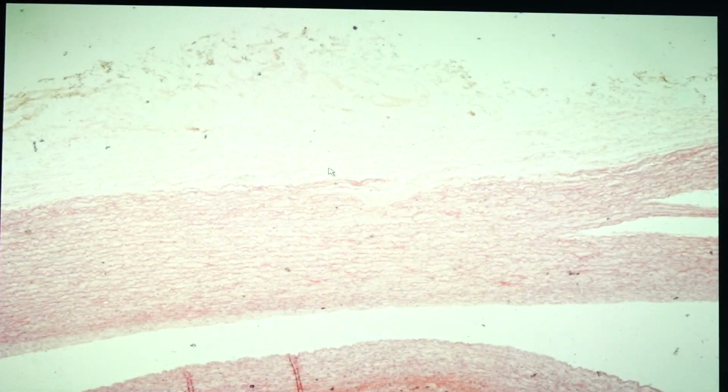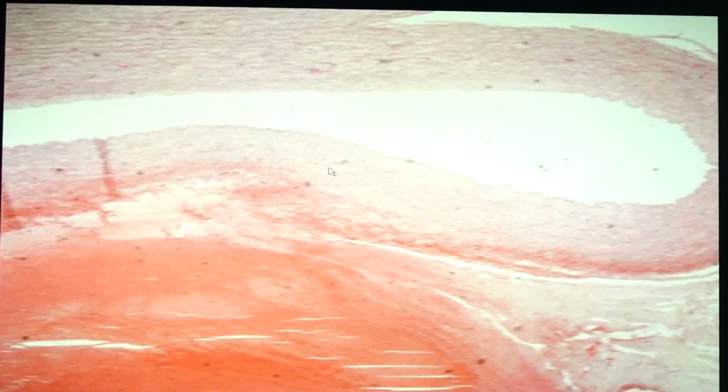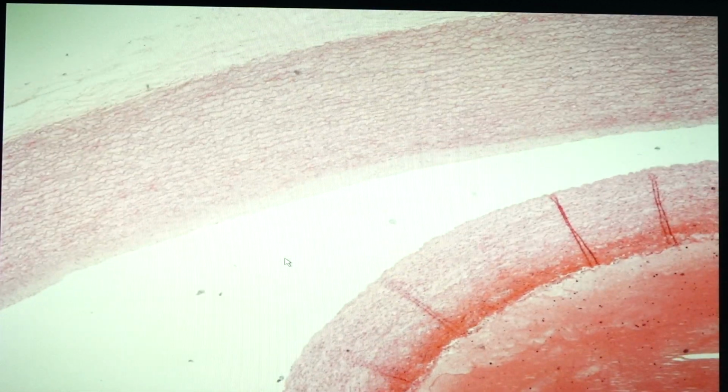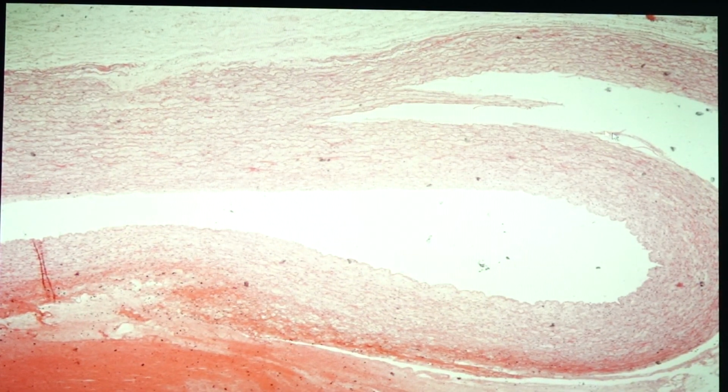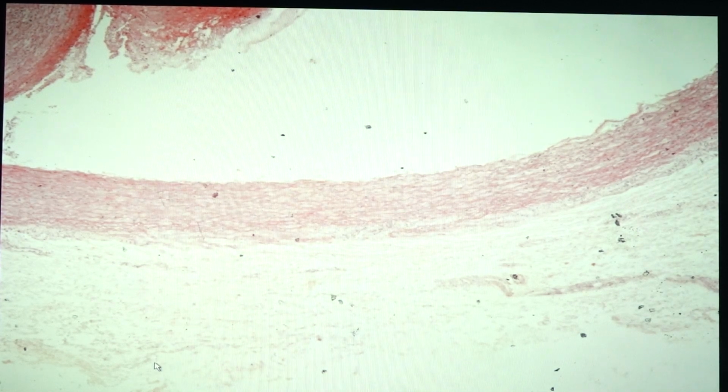And our last slide for this session would be slide 147, which is aortic dissection. So aortic dissection can be a medical emergency, a surgical emergency, and this would be caused by the presence of an intimal tear. So this is the original lumen of the aorta. Okay. And you can see here the presence of a tear. There would be an intimal tear, and it will lead to the accumulation of blood into the tear. Sometimes it ruptures, producing a hematoma. Okay. And sometimes it can be lucky, it produces another intimal tear, causing what they call a double barrel aorta.